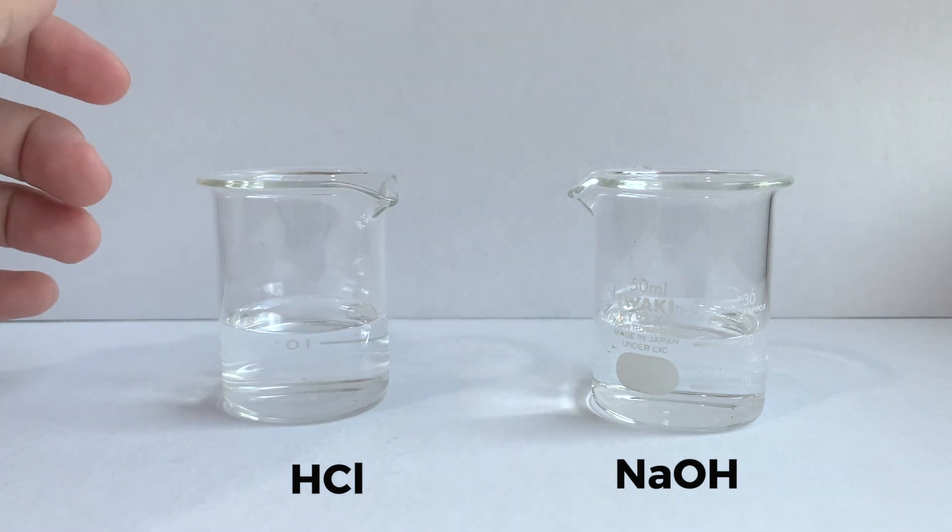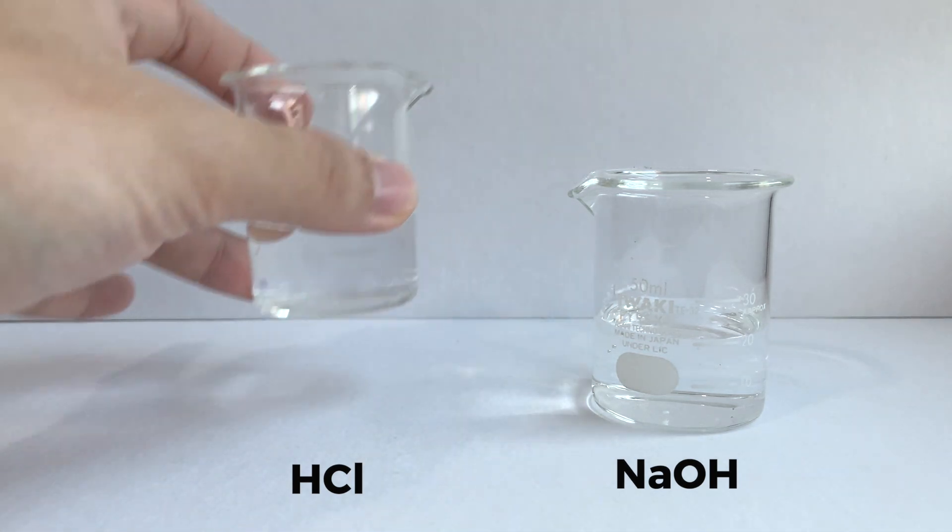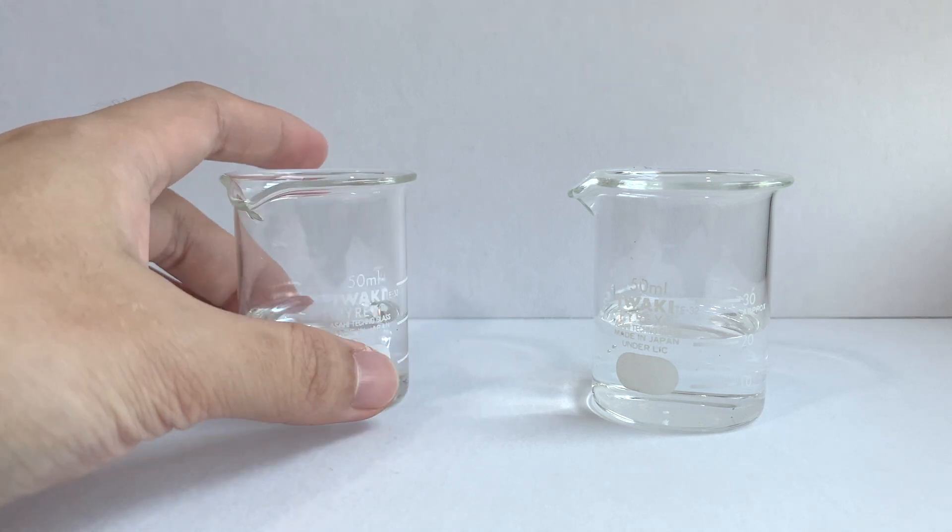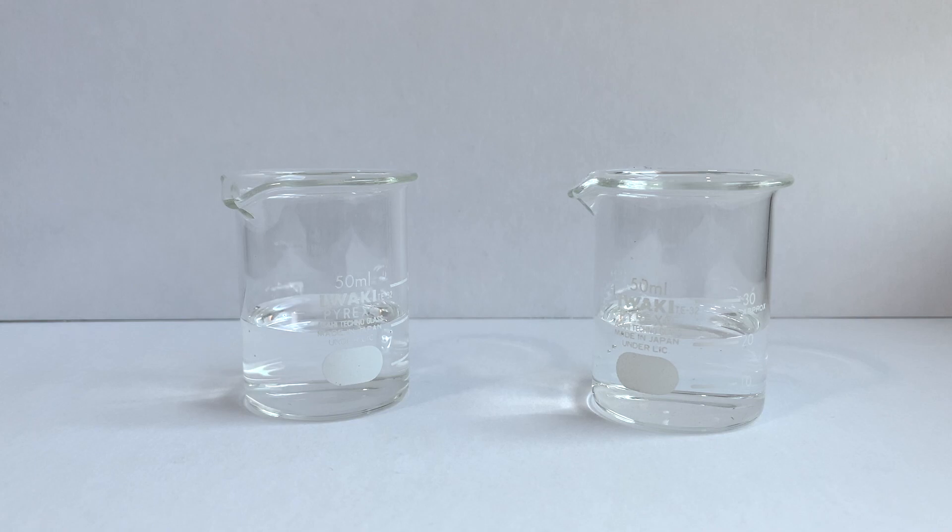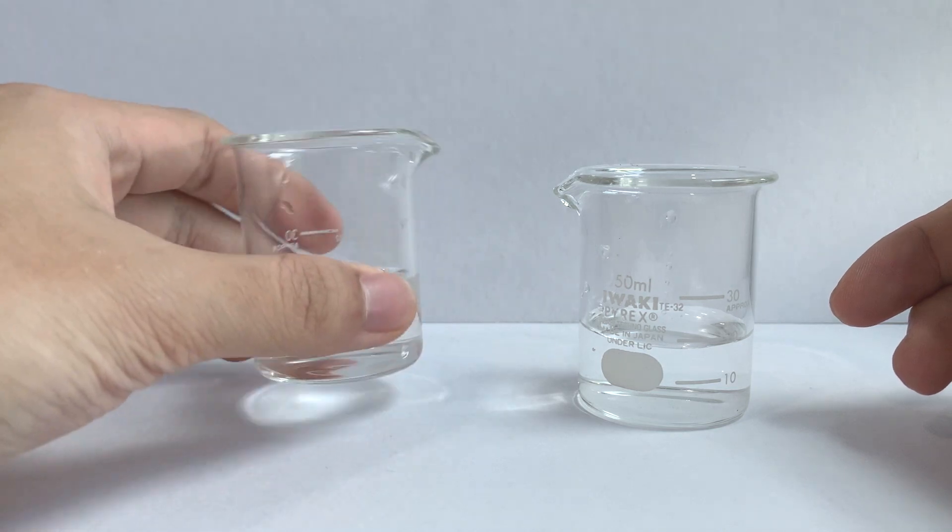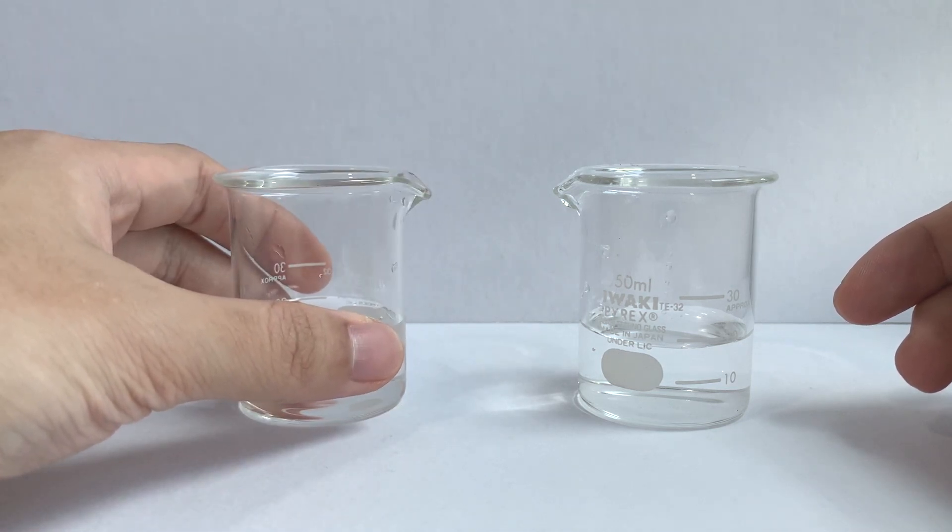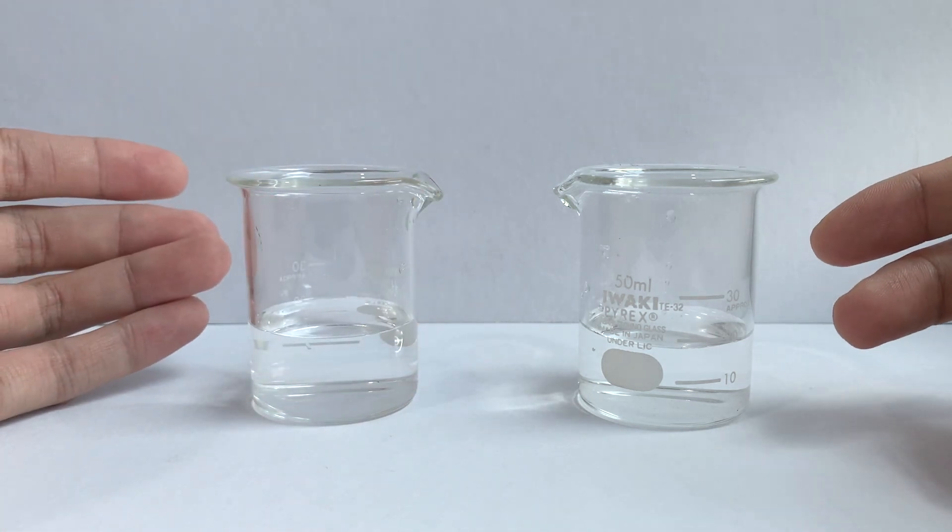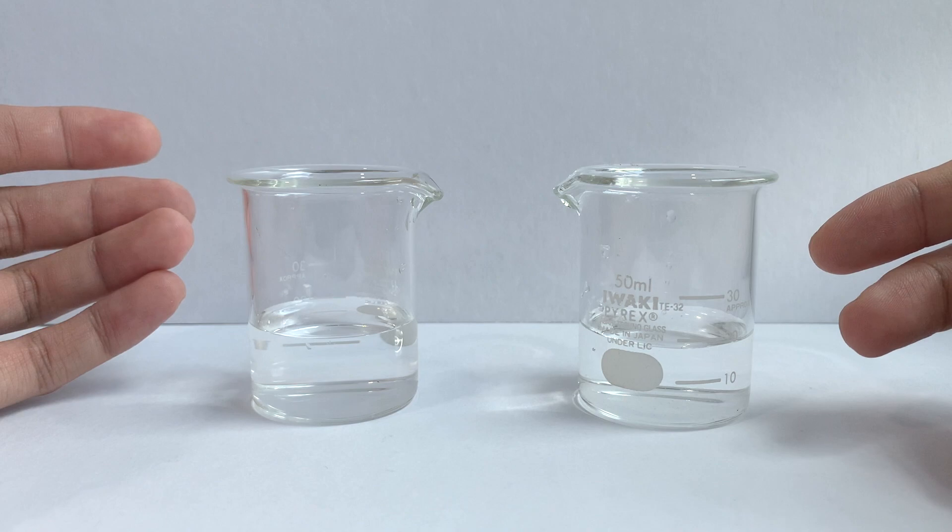To prepare sodium chloride is it as simple as taking the acid and just pouring it into the alkali? What problems might arise? Pause the video and think through this. The first issue is if I were to mix the solutions just like that in the beaker, how much of each do I need to use? I do not know their concentration so I can't calculate the volume I need for each of them.